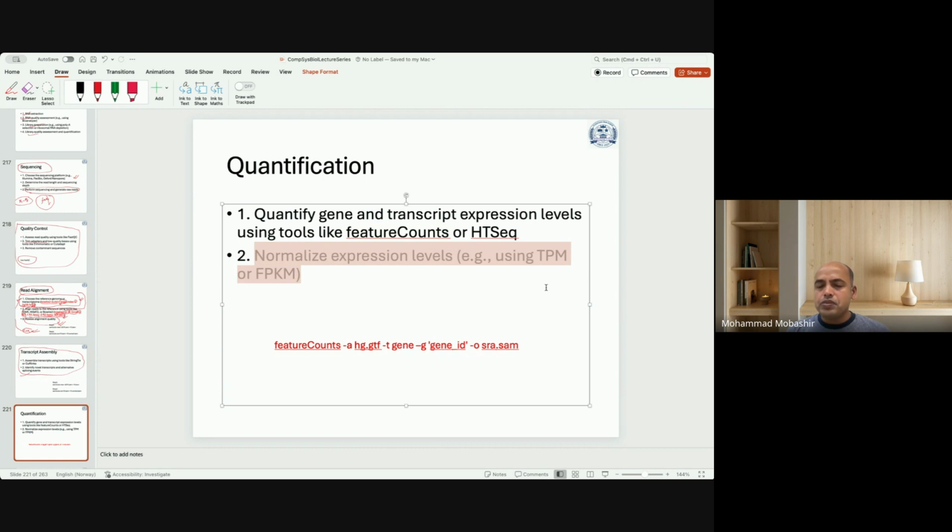You could use any other software, but if you are good in bioinformatics or you have basic class 10 level mathematics knowledge, then you just need to remove most of the values, or all the values, which are less than or equal to 10, and then use log 2 to convert them into suppressed values. This automatically removes most of the outlier values.